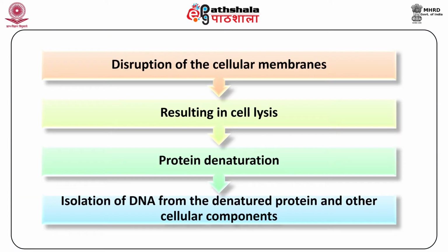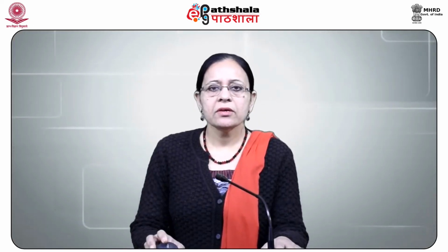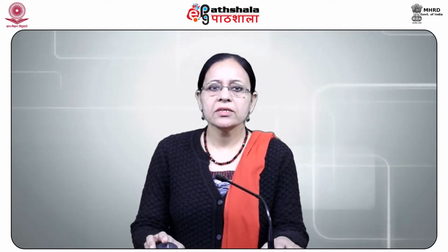The three stages of DNA extraction can be classified as disruption of the cellular membranes resulting in cell lysis, protein denaturation, and finally isolation of DNA from the denatured protein and other cellular components. Some of the extraction methods usually applied in forensic laboratories are described.